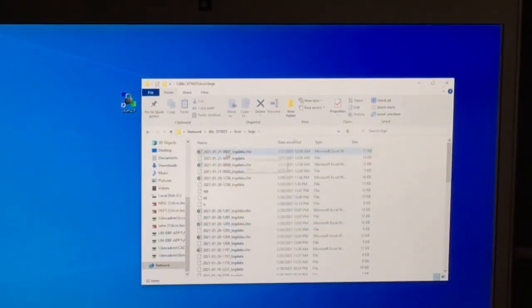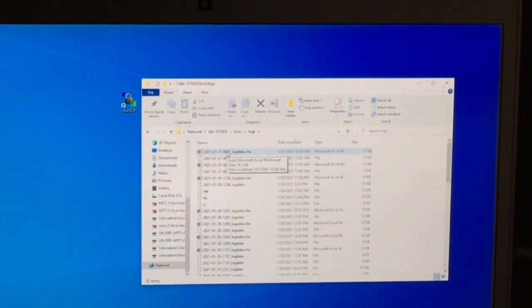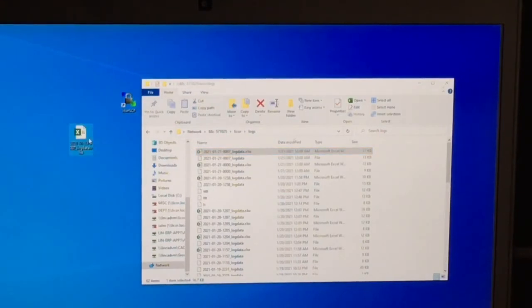Just copy and paste your file to the location you would like to. Or, you can just simply drag the file to the desktop of your computer.